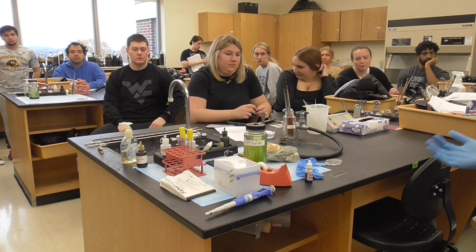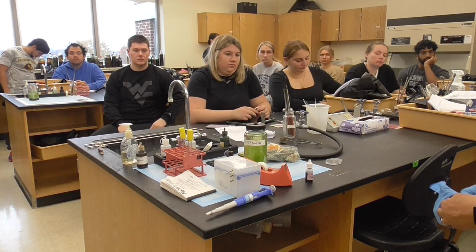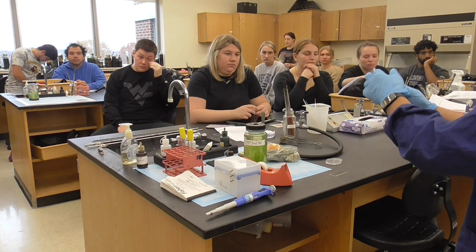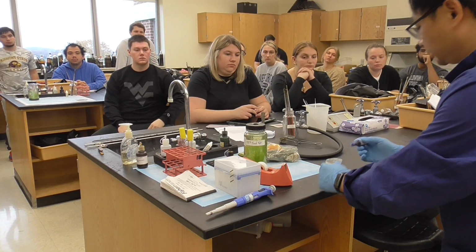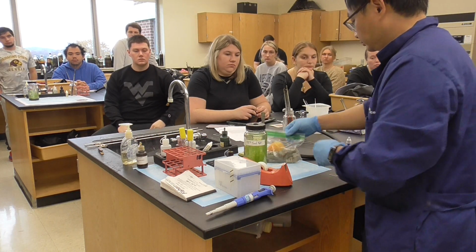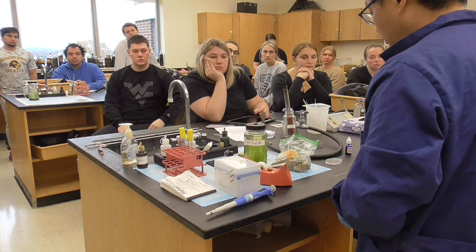How do you do it? There are several ways to do it. I would do an easy way for you. Lactophenol cotton blue, shake a little bit. Add one drop right in the middle. That's good. Now this is going to be open a little bit. Don't block it.